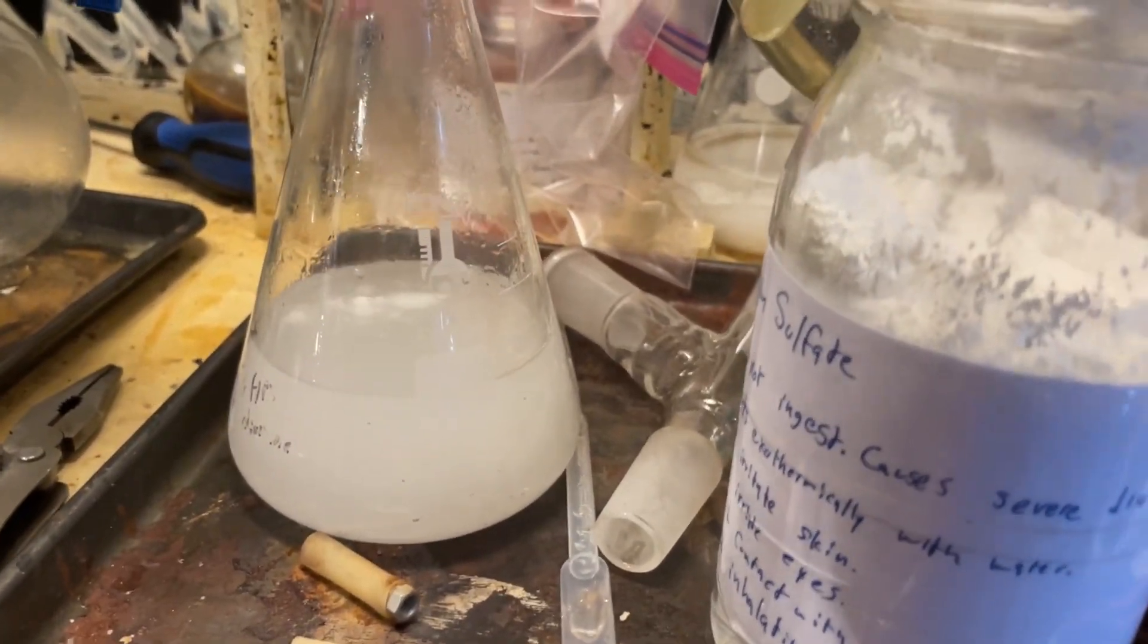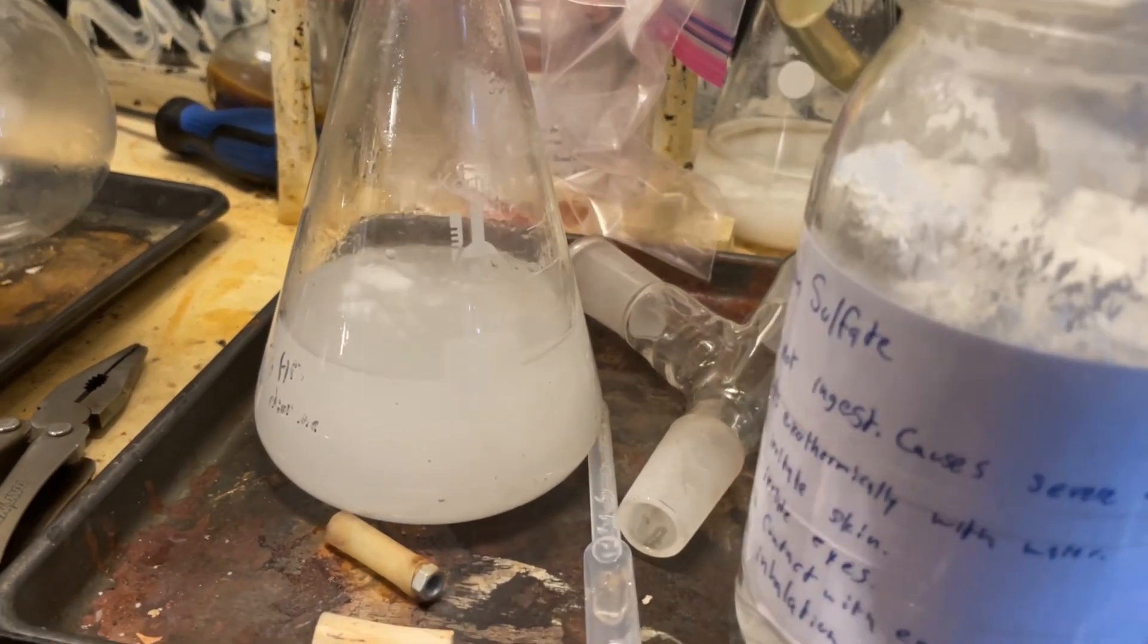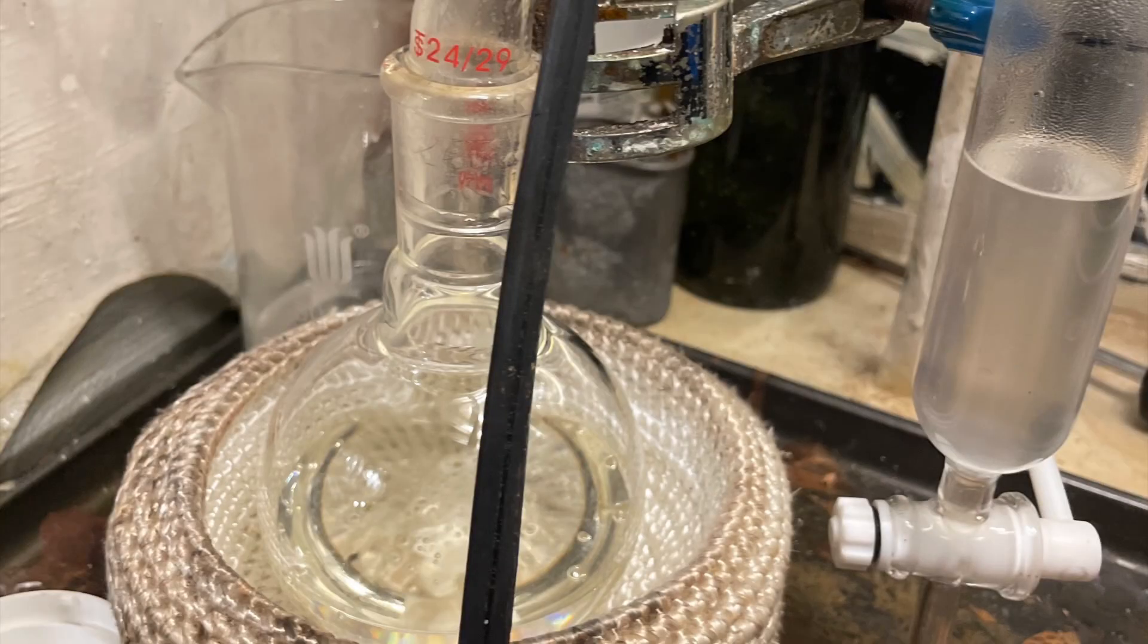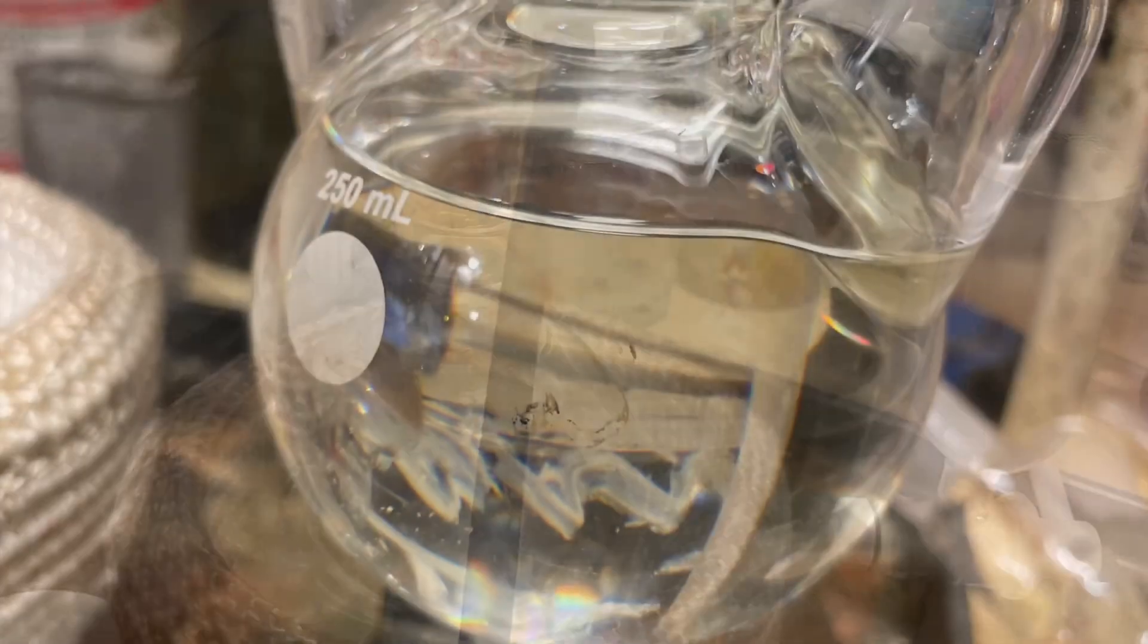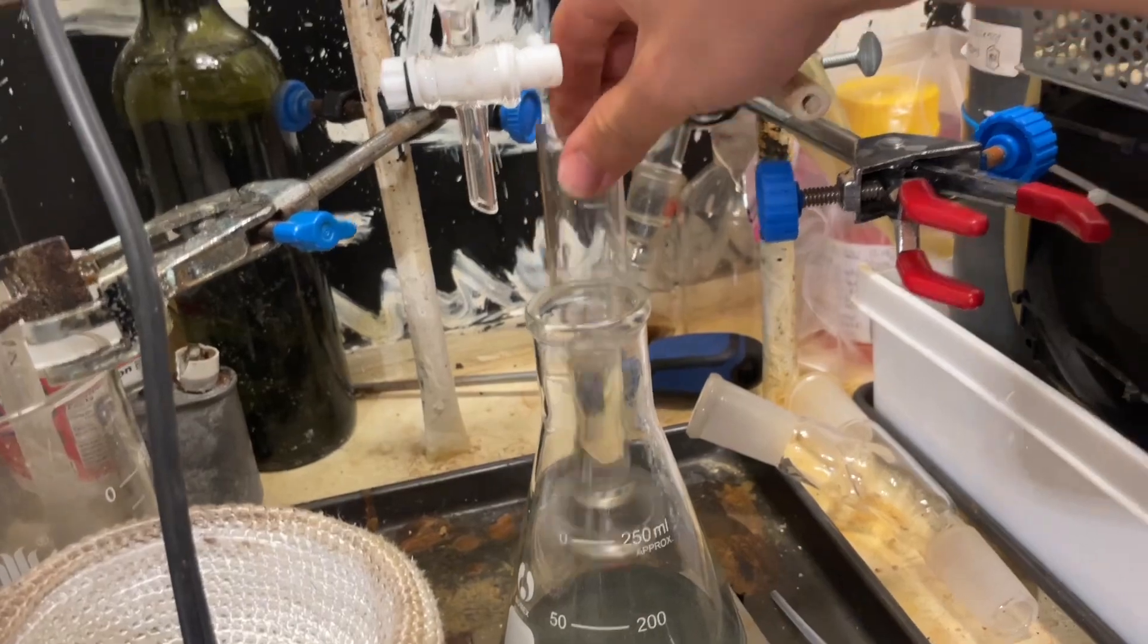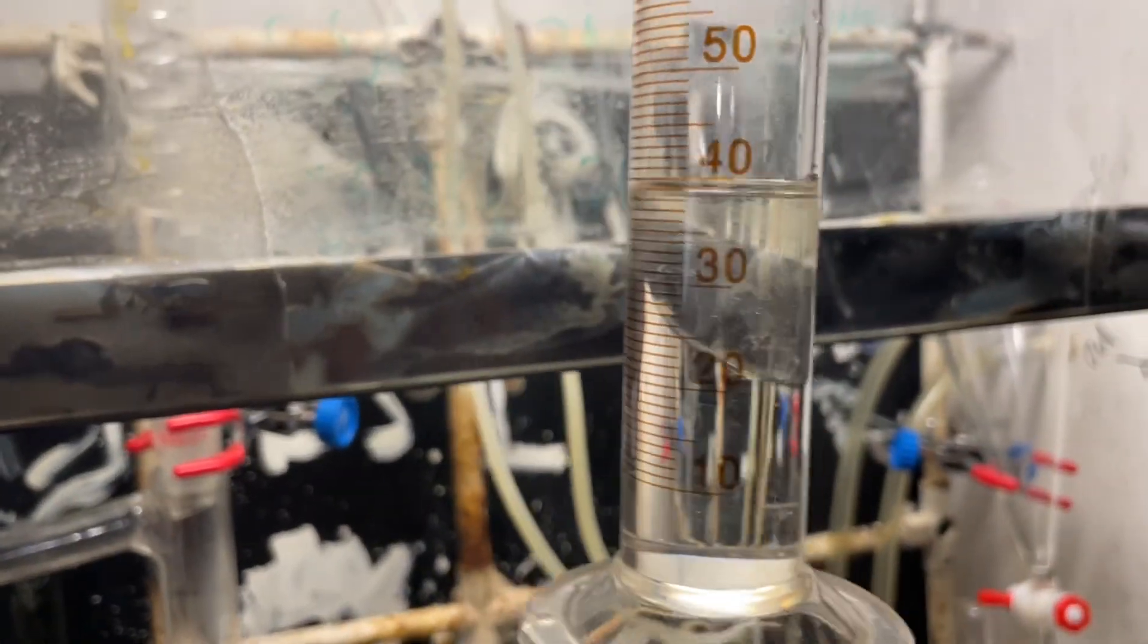So, after separating the dichloromethane, I dried it with some magnesium sulfate. You cannot use calcium chloride because it's complex with the benzyl alcohol. After distilling the dichloromethane off and combining it with the other benzyl alcohol we have, we have approximately 200 milliliters or so, which is a great yield, considering last time I got 100.